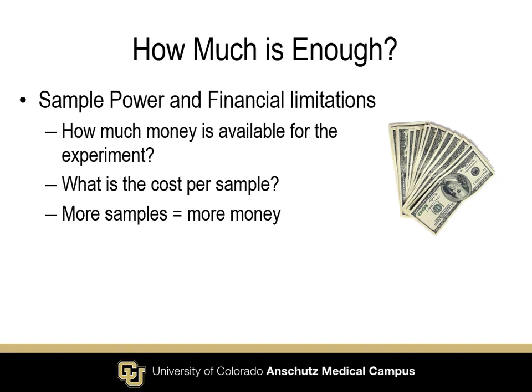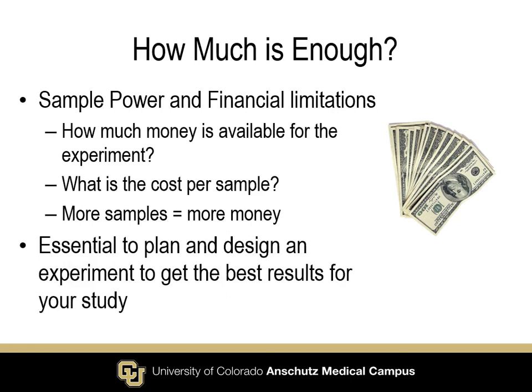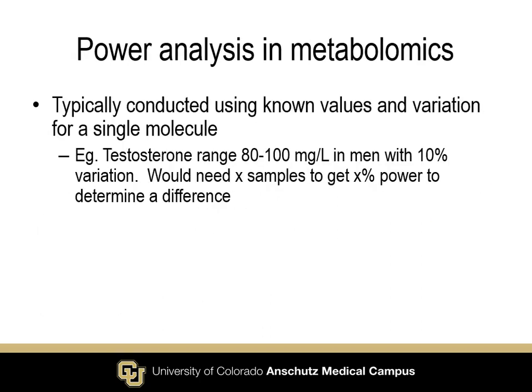Ideally, in a perfect world, if we had hundreds of thousands of samples to test our hypothesis, that would be great, but we know in reality that's obviously not possible. But again, it's essential to plan and design an experiment beforehand so that you can get the best bang for your buck. And for example, we'll bring back the power analysis for metabolomics.